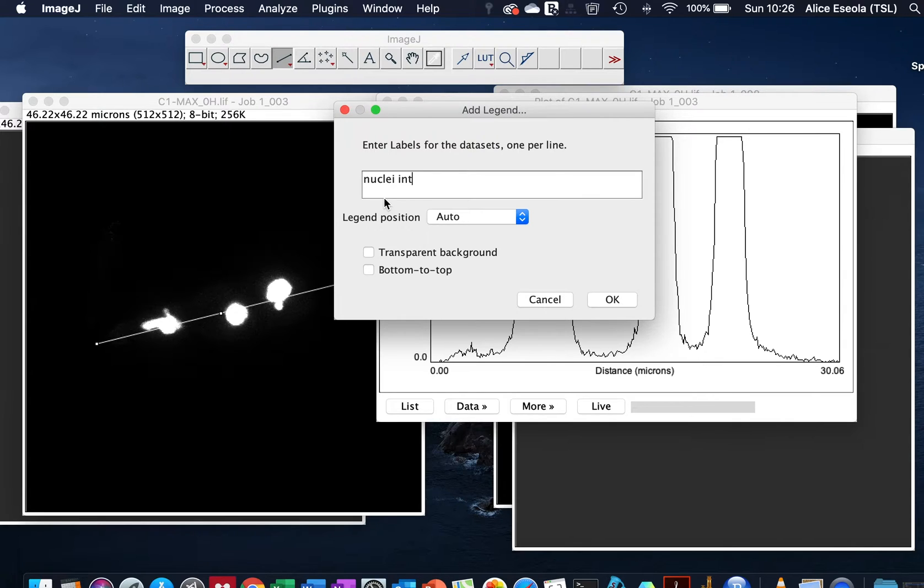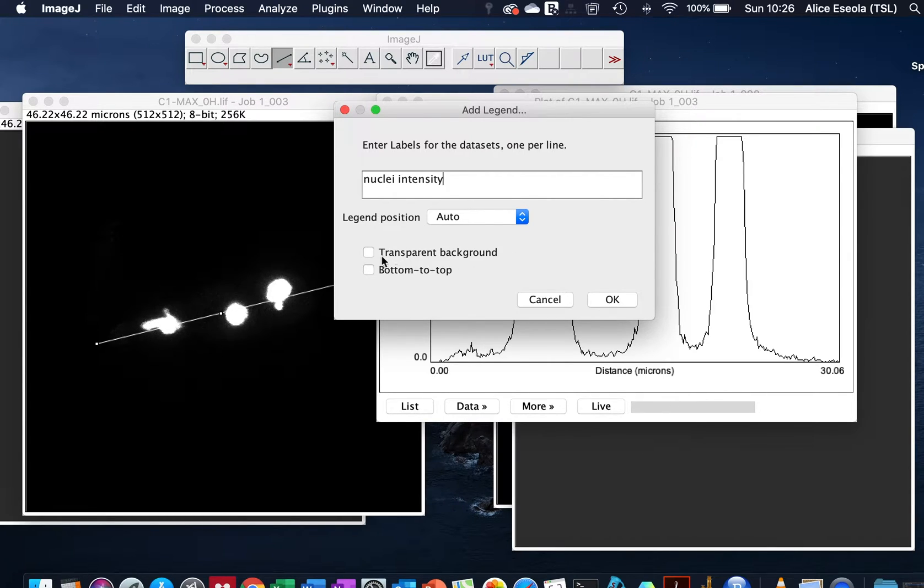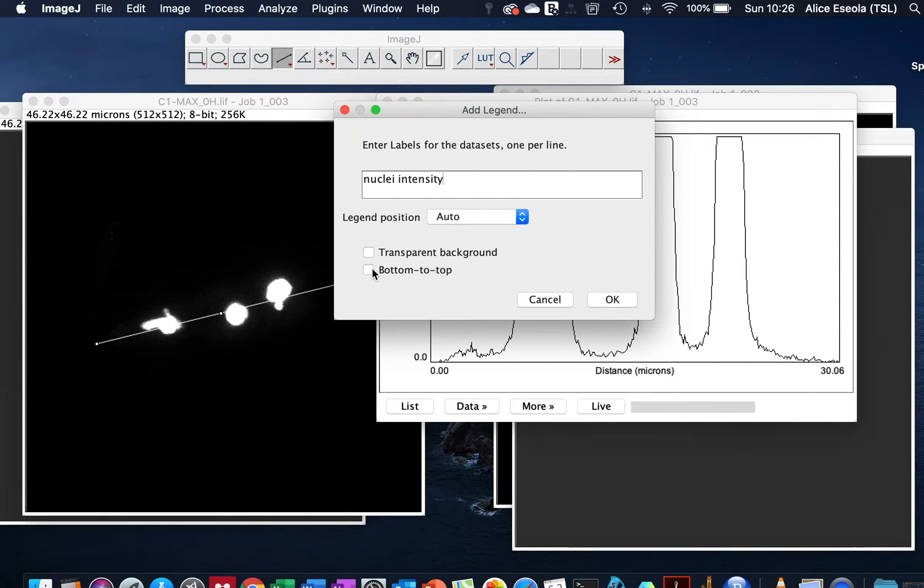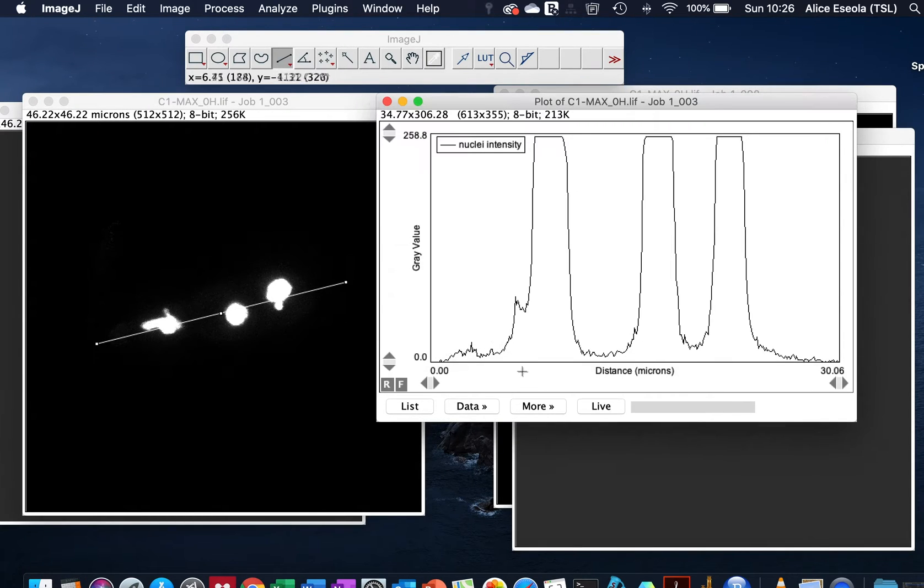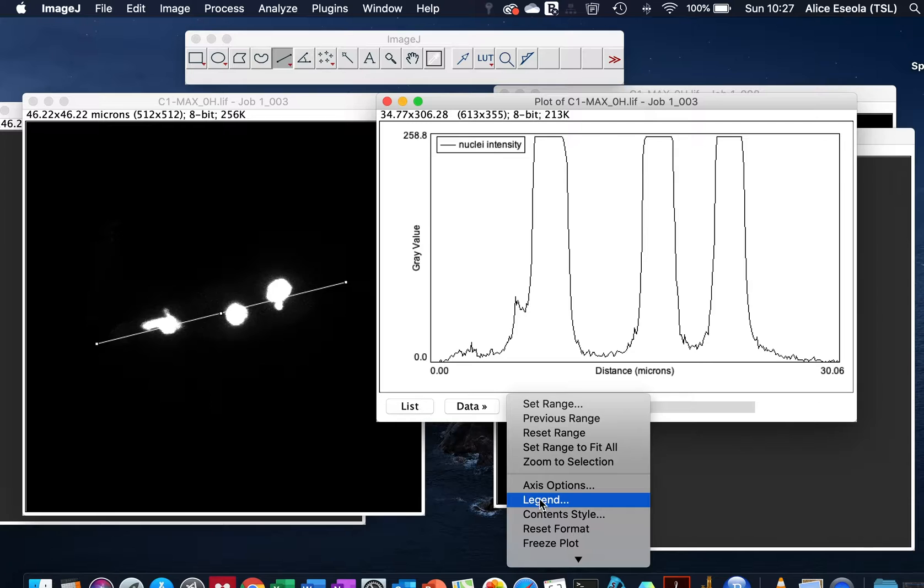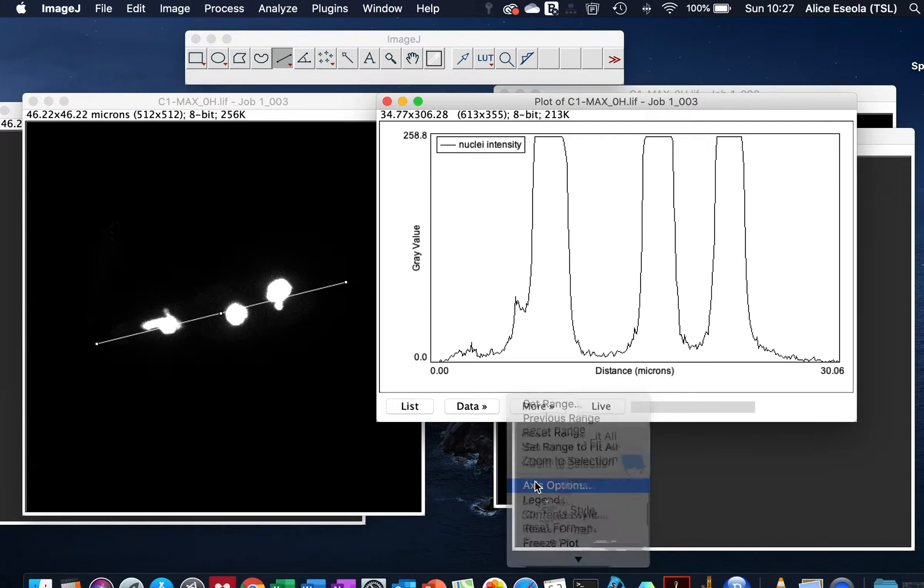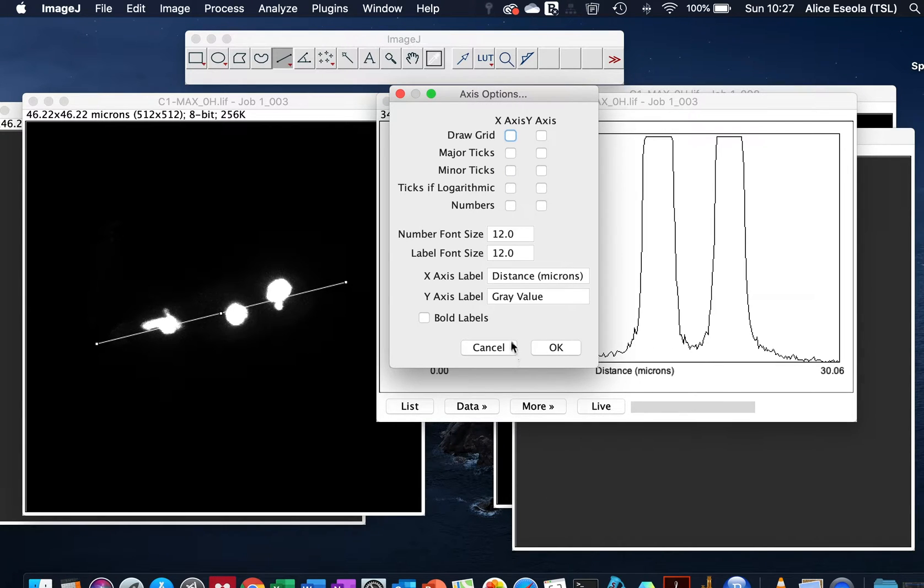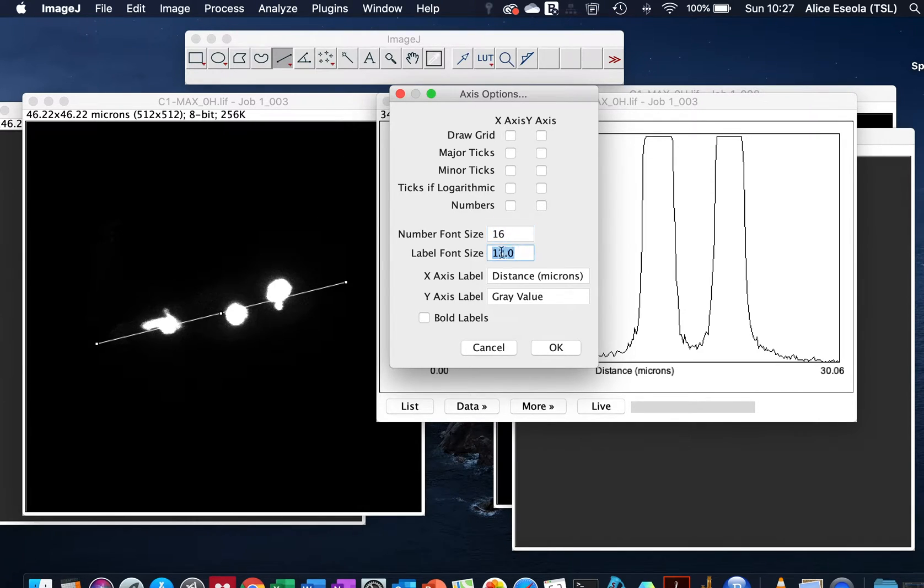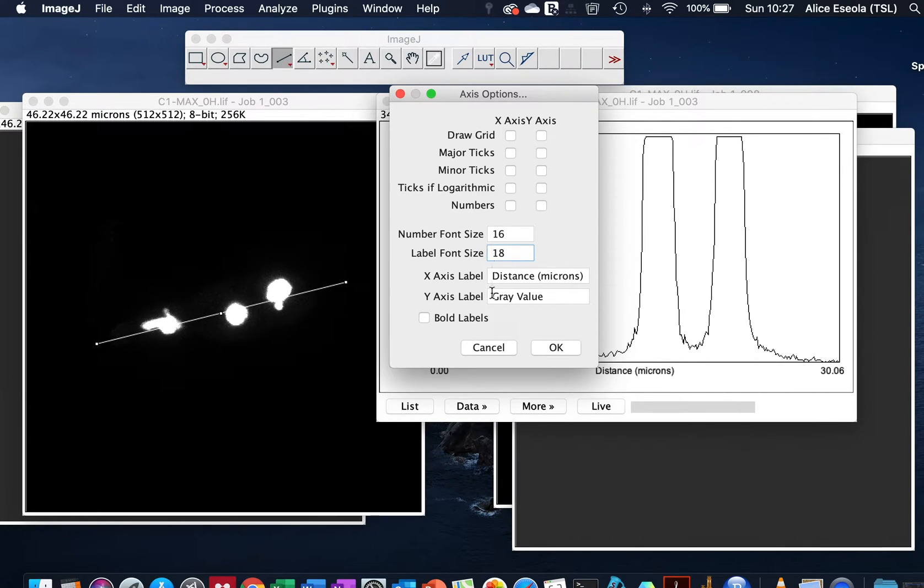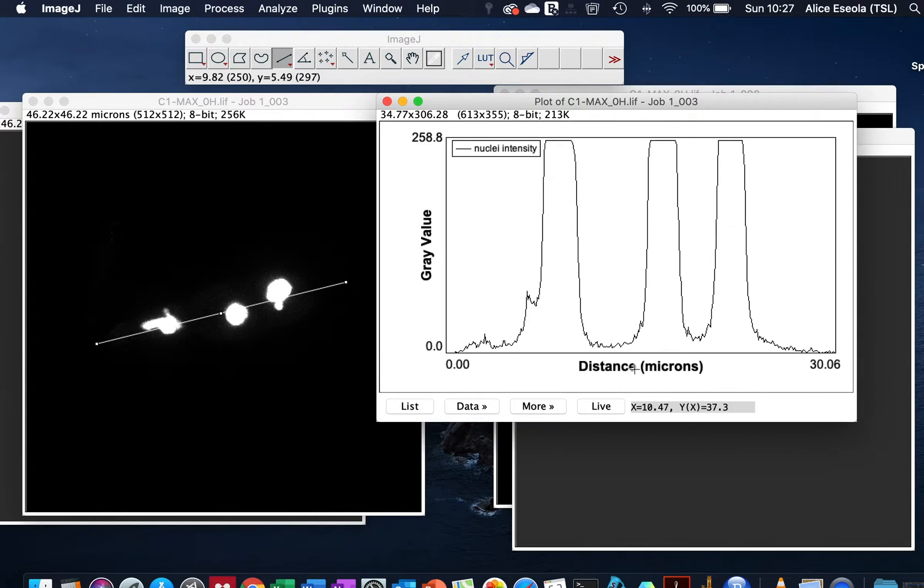Nuclei intensity - we could put this at the bottom. To increase the font size we go to More, Axis Options. Here we can give our font size to be 16 and a label as 18 to demarcate it from the font. Also we want the label to be bold, so here you have your legend as bold.